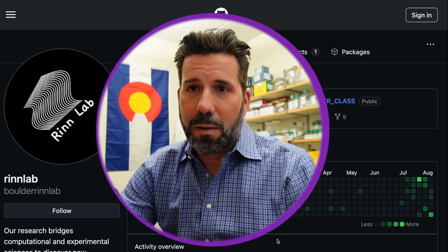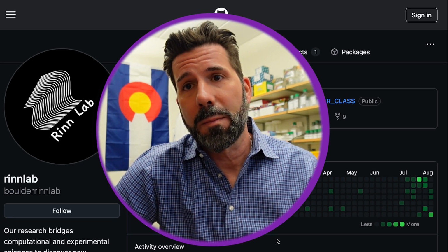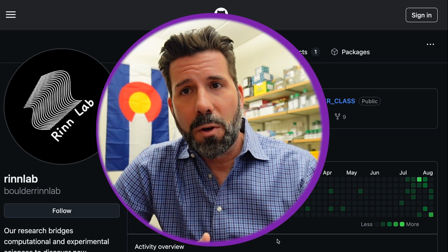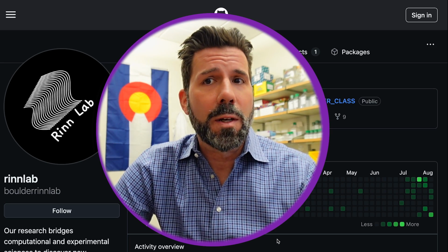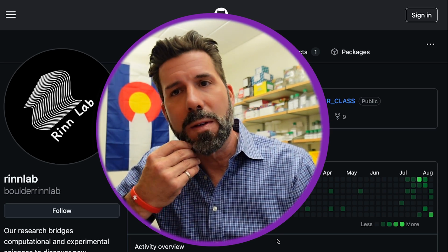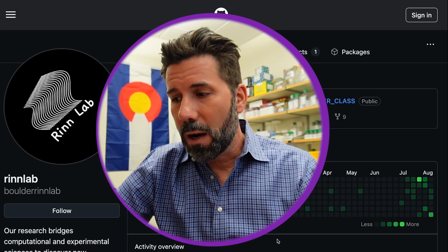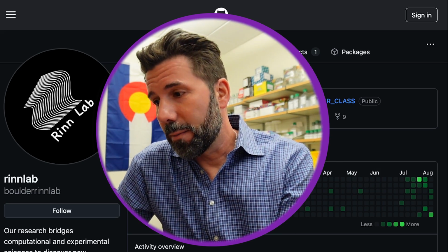Today we are going to start to explore our results. We've collected them all into one data frame, and now we're going to do some real genomic analyses and say which genes are significant, which are changing across time, what does base mean, and these kinds of things, to learn some of the fundamentals of RNAseq, some basics of R, all while analyzing our data.